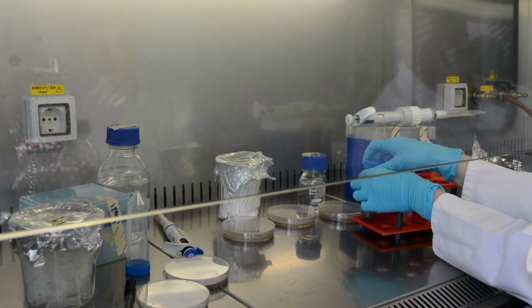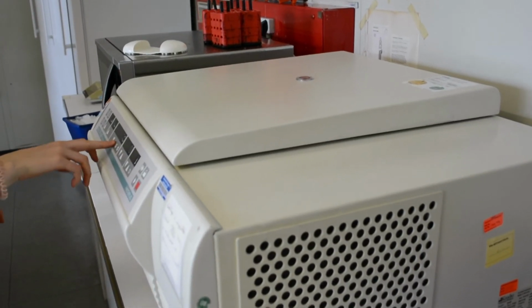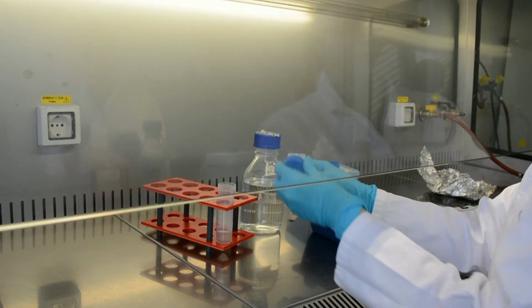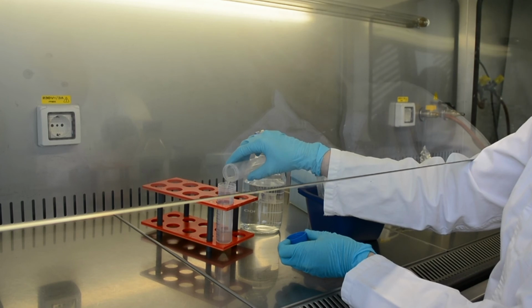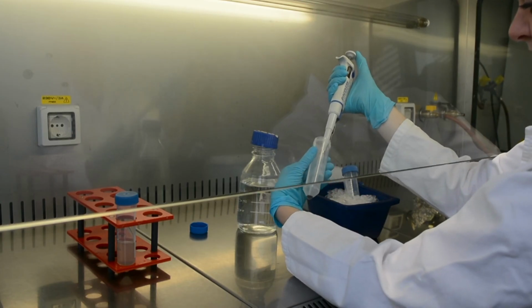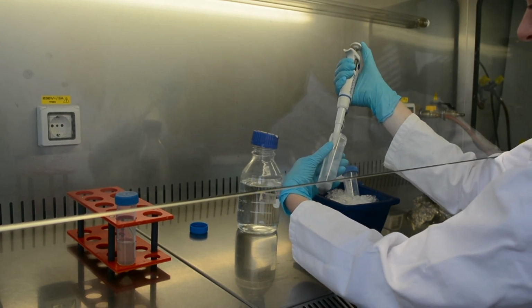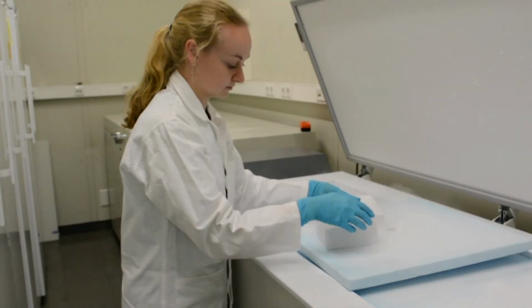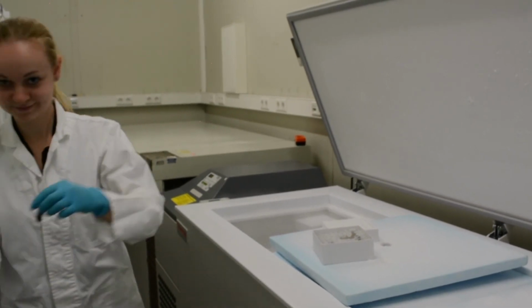Now centrifuge the falcon at 2100 G for 10 minutes at 4 degrees Celsius. From now on, it is important to keep the solution on ice. For freezing, discard the supernatant and resuspend the pellet in an appropriate amount of 30% glycerol. Usually, the amount of spores from 3 plates can be resolved in 1 ml of glycerol. Spores can now be stored at -80 degrees Celsius for a few years.